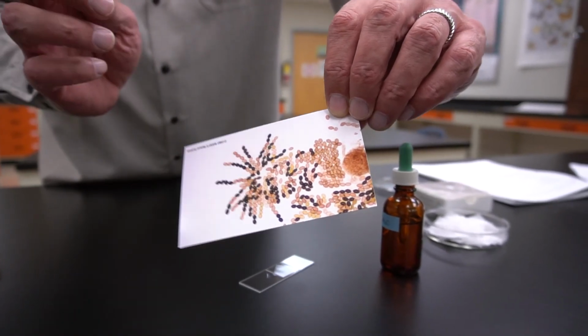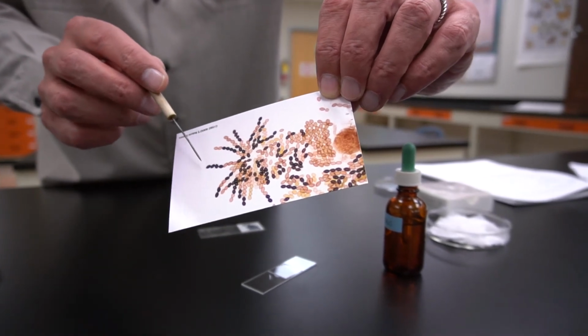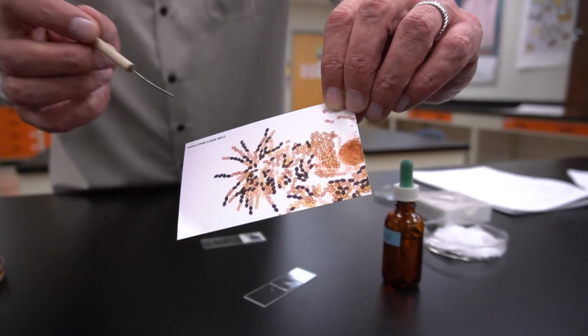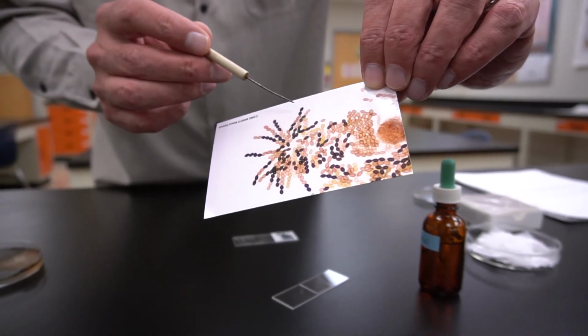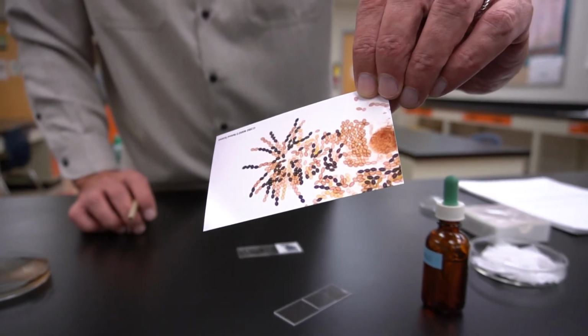Now there's 3 kinds we care about. There is 4 to 4, which indicates that no crossing over has occurred, and then there's 2 to 4 to 2, which indicates a crossover, and also 2 to 2 to 2 to 2, which indicates a crossover.